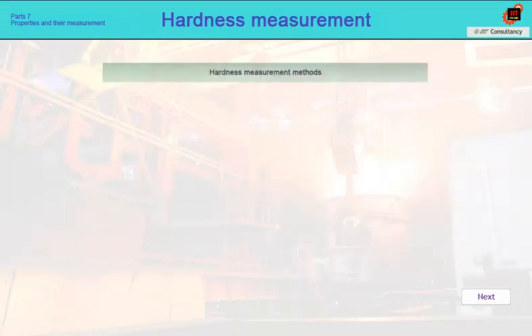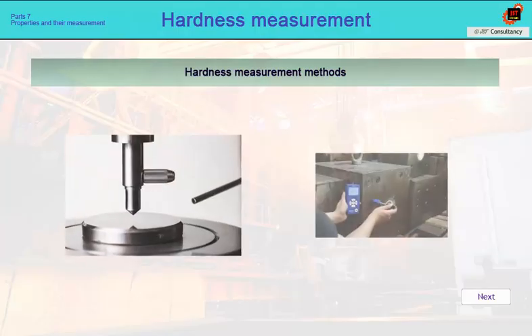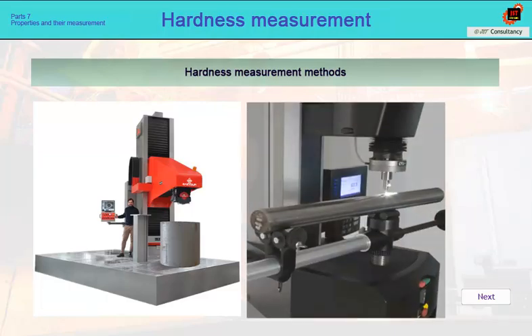From the above, it can be concluded that hardness measurement is the basic method for evaluating the properties of parts and materials, and is also the most frequently measured, usually the only quantity by which we evaluate the result of heat treatment immediately after its execution. Correct hardness measurement is therefore decisive for assessing the correctness of the heat treatment performed by us. It is in the interest of every heat treater to measure hardness correctly, without unnecessary errors, and as accurately as possible. Therefore, we should know more about this field of measurement.